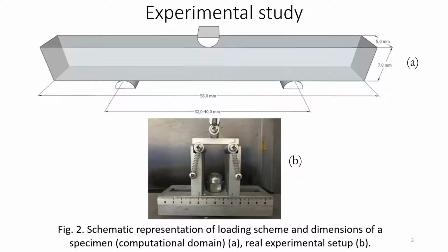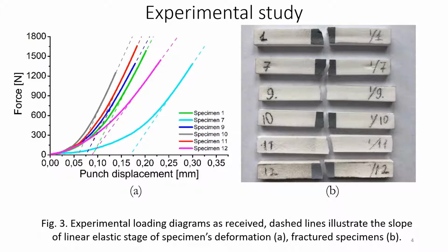In the slide you can see the principal loading scheme as well as real experimental setup. Figure 3 illustrates as received loading diagrams of 6 specimens and final experimental fracture patterns.